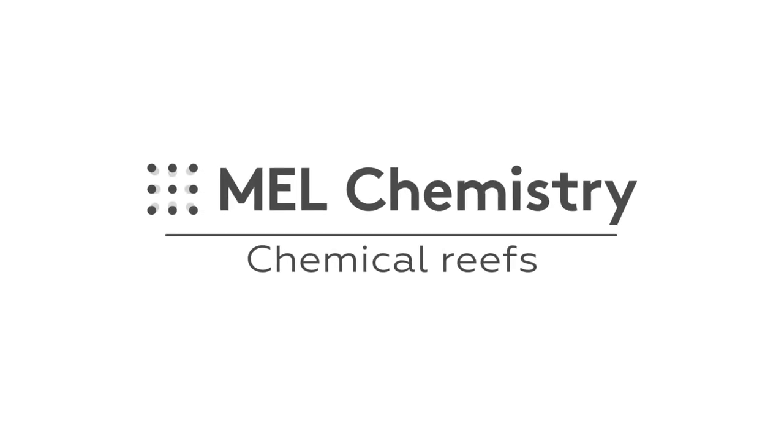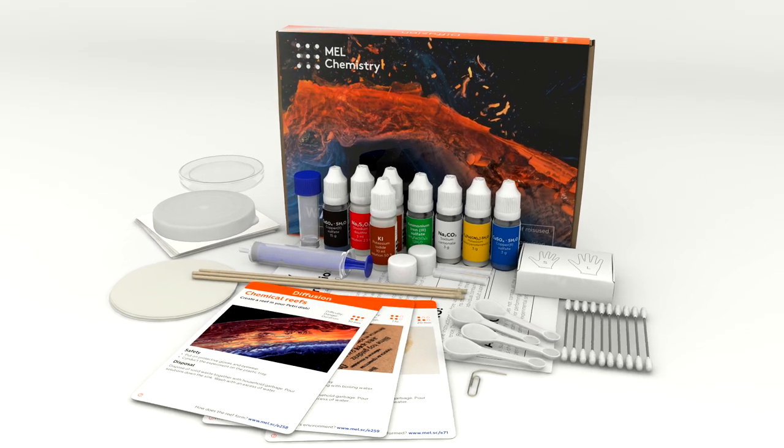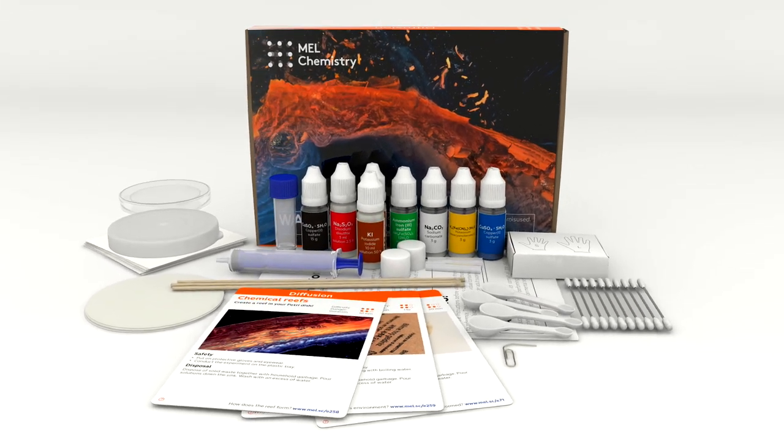Welcome to the wonderful world of chemistry. Today, with the help of the diffusion set by Mel Chemistry, we will learn how to make a reef in a petri dish.